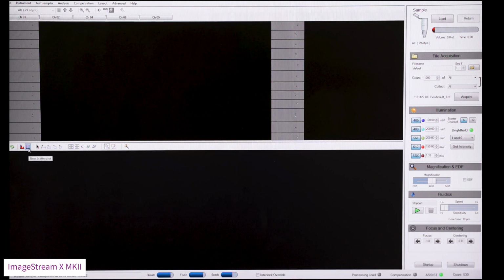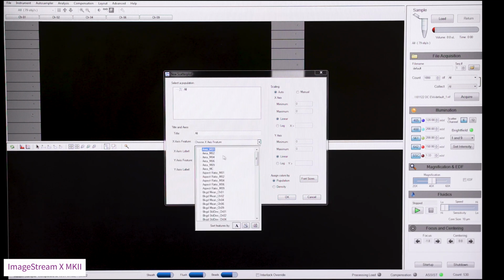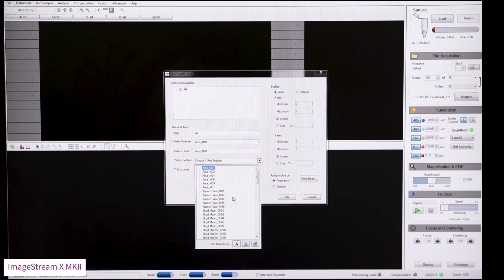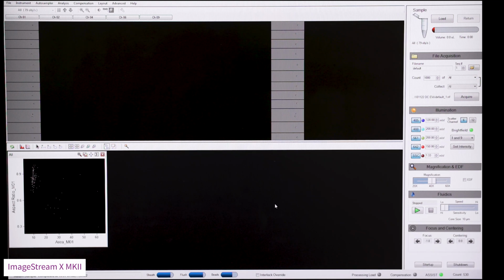In the software, we can create some of the plots we need. Start by pressing New Scatter Plot and select the X-axis feature Area M01 and the Y-axis feature Aspect Ratio. The resulting plot uses the data from the bright field image to calculate the area and aspect ratio of any event, and it enables us to choose the cells of interest for our study.